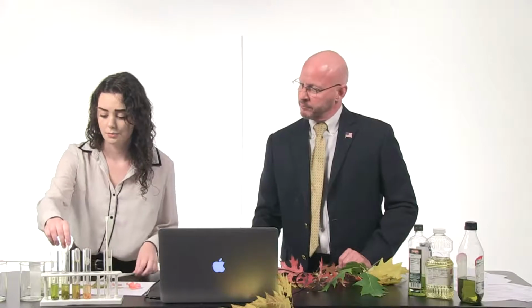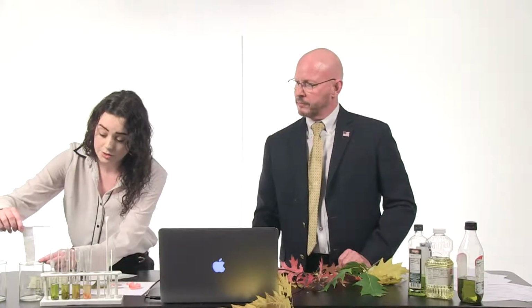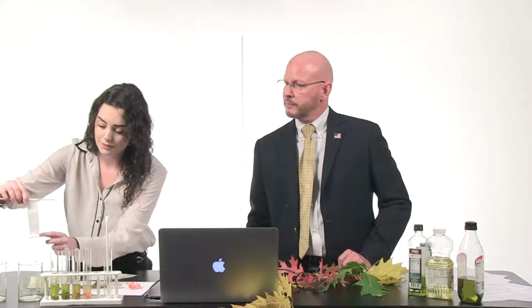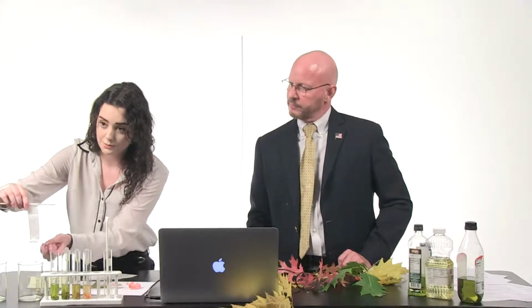Then what we're going to do is take 1 drop. What I did was cut the sealed edges, then I opened it and cut down horizontally to create strips, and then I just used some tape. You can use toothpicks. This is just a setup. Then you take 1 drop, and right at the very bottom where you draw a 2 centimeter mark, you're going to add a drop to the paper so that it's going to move up.